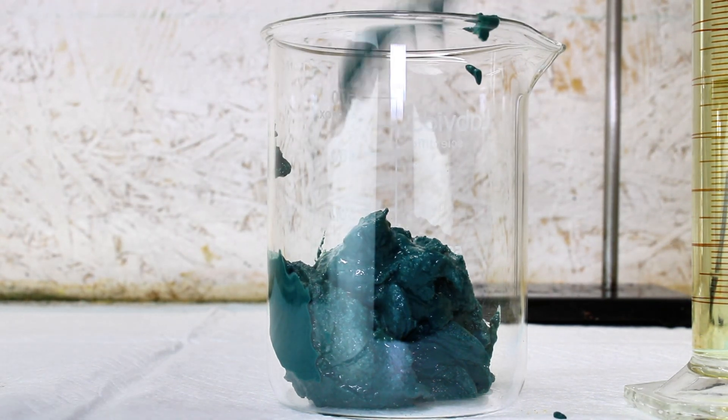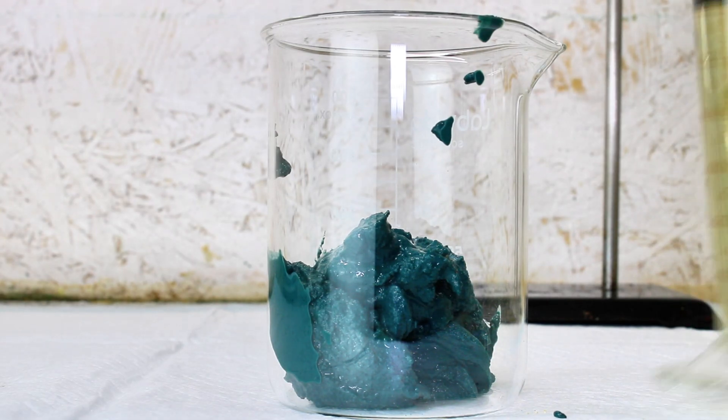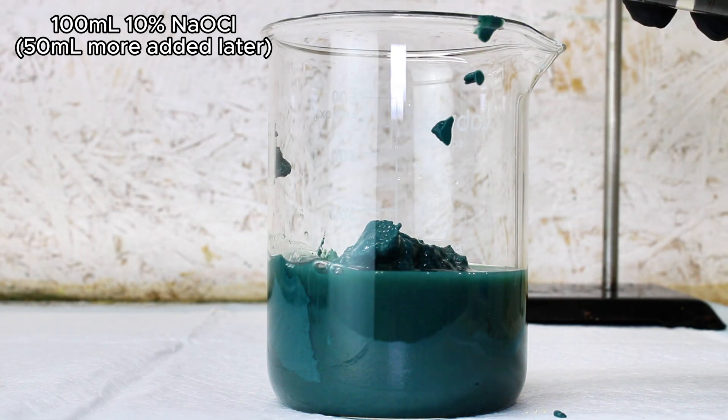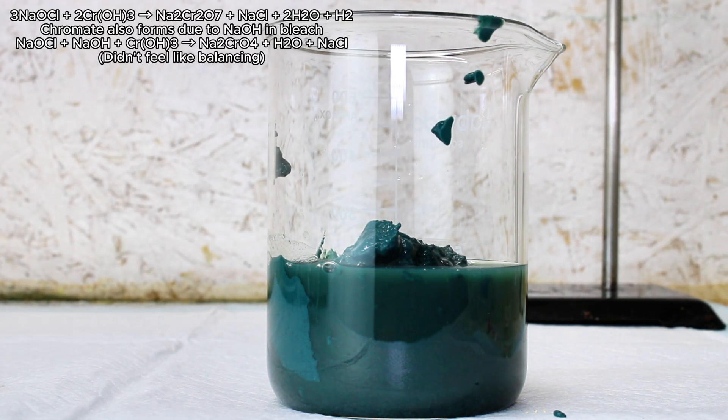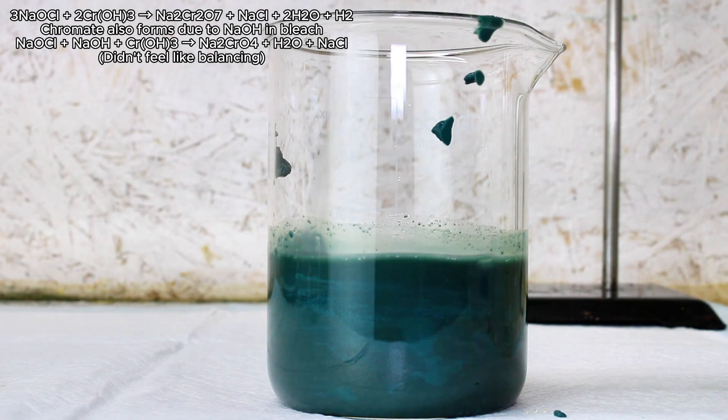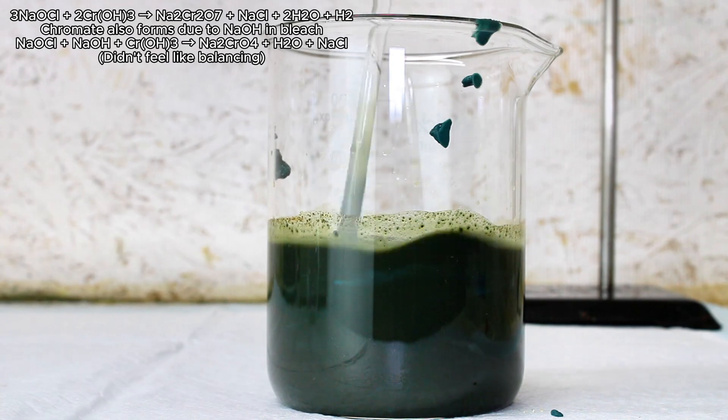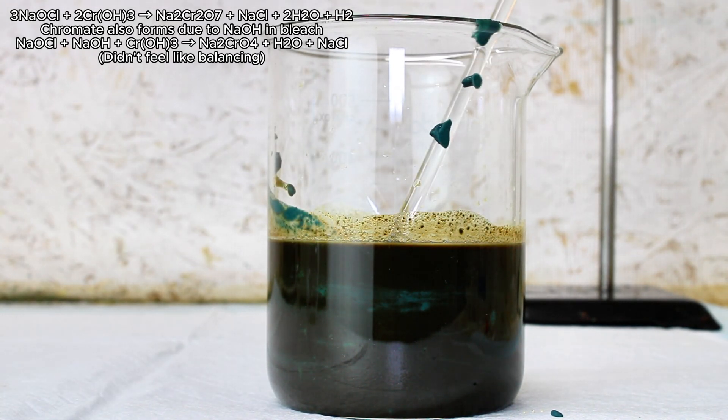In any case, my next step was to add about 100 milliliters of a 10% sodium hypochlorite bleach solution and give it a good stir. Sodium hypochlorite is an extremely strong oxidizer for how weirdly readily available it is, and it will easily oxidize the chromium hydroxide to sodium dichromate and sodium chromate.